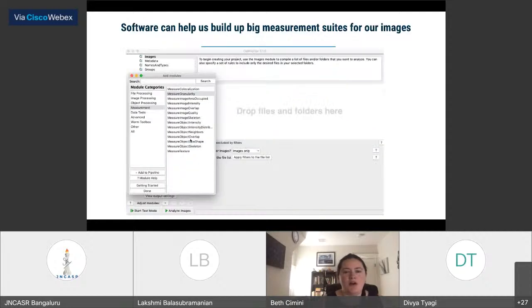But almost always your image analysis pipeline doesn't just end at finding objects. It then involves measuring them in some way. Sometimes a pipeline only needs counts, and that's absolutely fine. But very often you might want more measurements, and I'm going to talk later about exactly why you might want lots and lots of measurements.